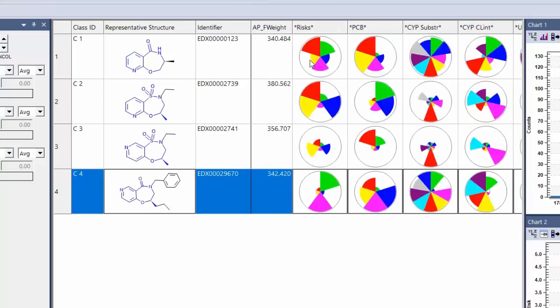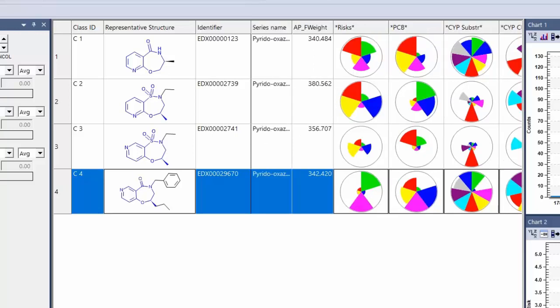This is a breakdown of the ADMET risk here, in terms of tox, in terms of... do we have the ADMET risk separate? Oh yeah, that's it. ADMET risk, then absorption risk, CYP risk, and so on. So if you have a completely different chemotype, the risk is probably going to come from a different feature, but the overall score is still comparable.